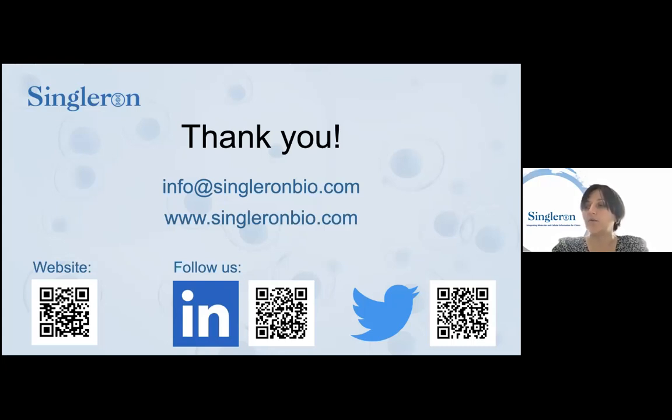If you want to use a less concentrated single cell suspension, then manual loading allows you more freedom, because you don't have to concentrate your single cell suspension as much as you would have to for the Matrix loading. But other than that, I don't think there are any notable differences. If you also would like to discuss further, you can use the raise hand button.